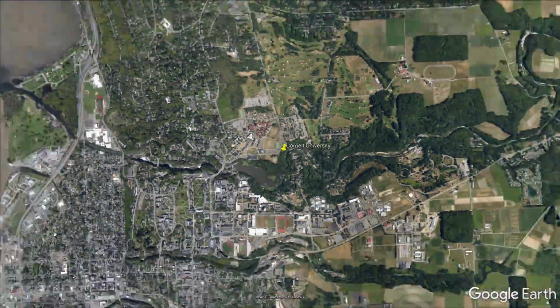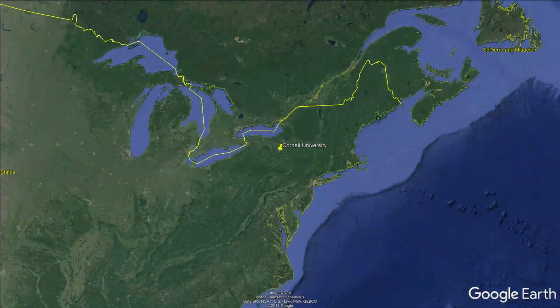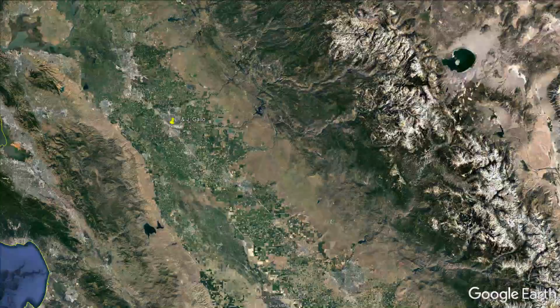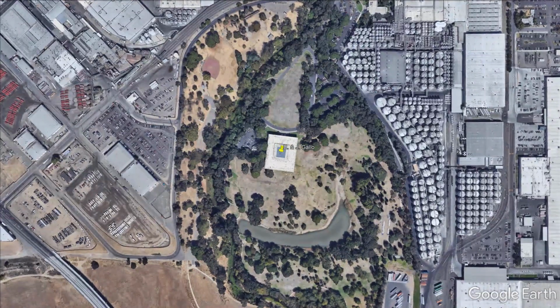But the good news is that most, say, winemakers already know what they're looking for when they're evaluating their products. And Gavin's team is going to field test their new approach soon. This summer, one of the other students in the lab is going out to the West Coast to work with E&J Gallo Winery. And the goal is to see if we can drop in SPMesh DART-MS as a replacement or something complementary to what they already are doing.